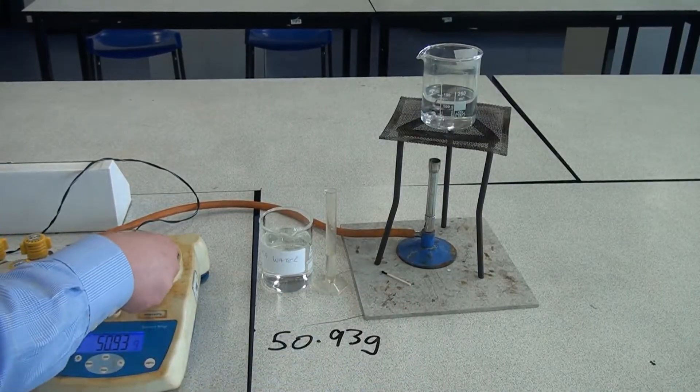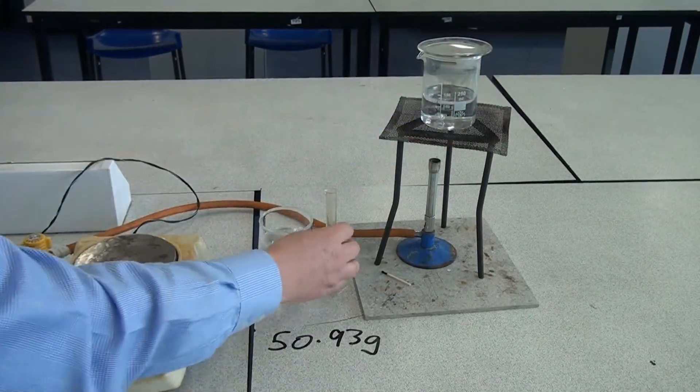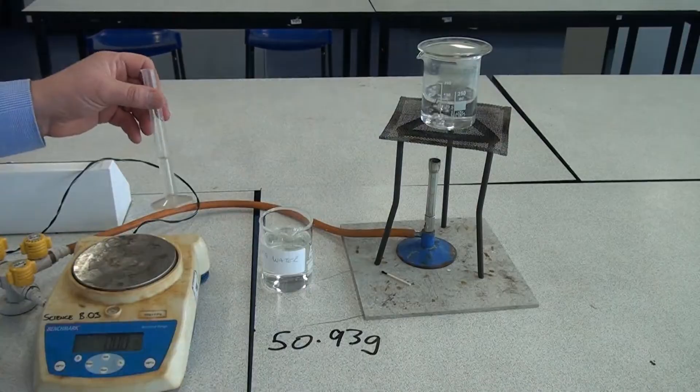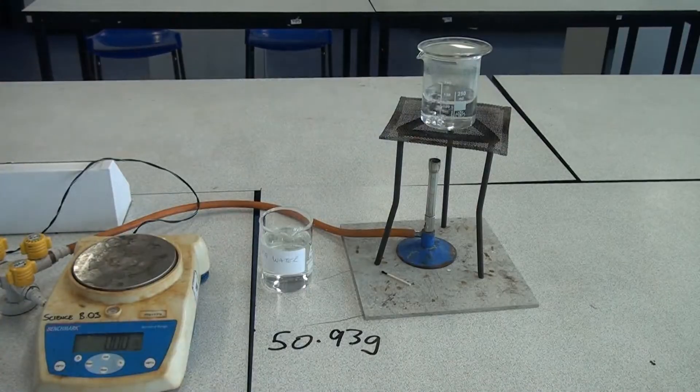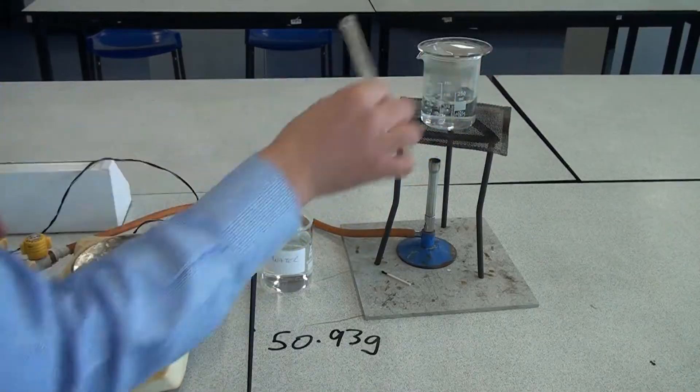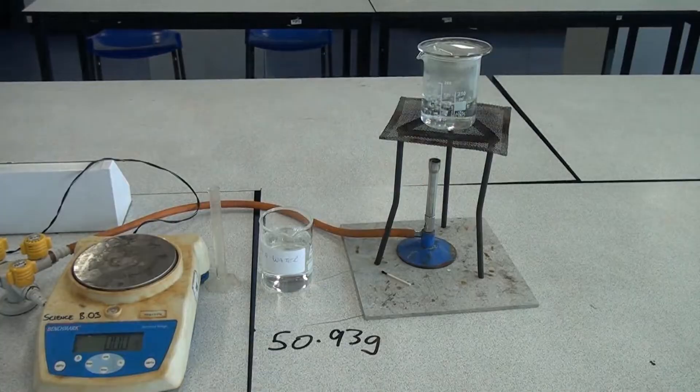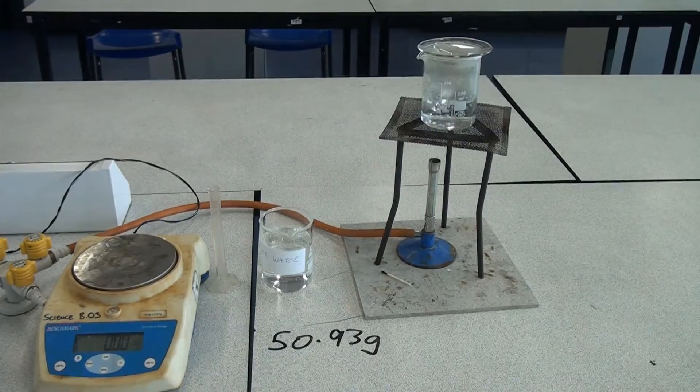And I'm going to place it on top of a water bath, and then I've got here a four centimeters cubed sample of the seawater which I'm going to pour into the watch glass that's above the water bath, and then I'm going to leave that. And the idea is that the water will evaporate and leave behind any dissolved salts that are in that sample of seawater.